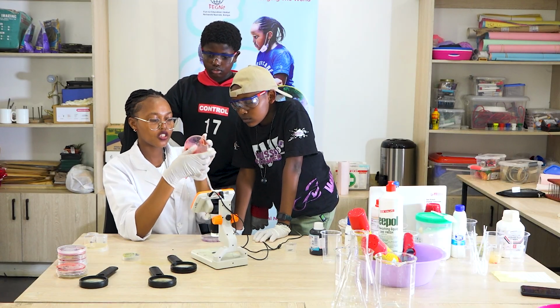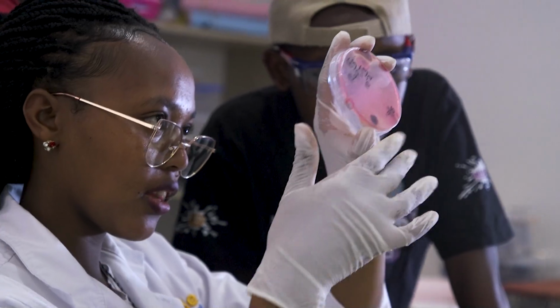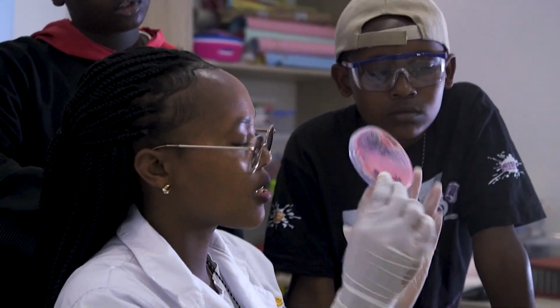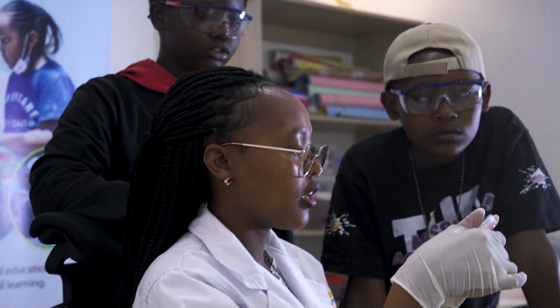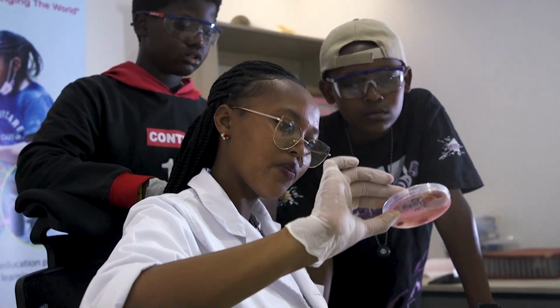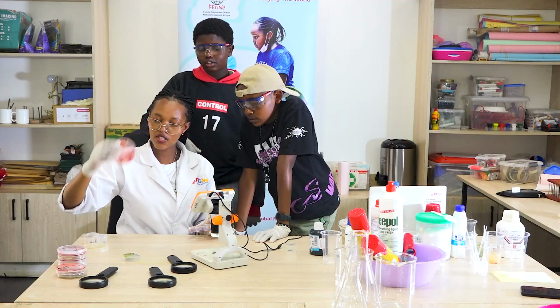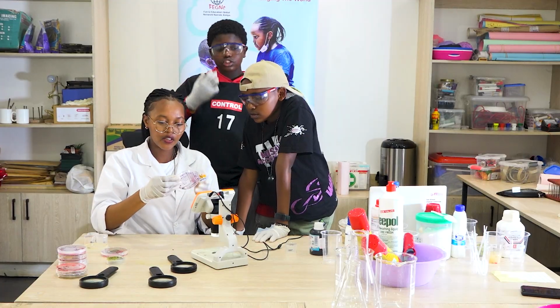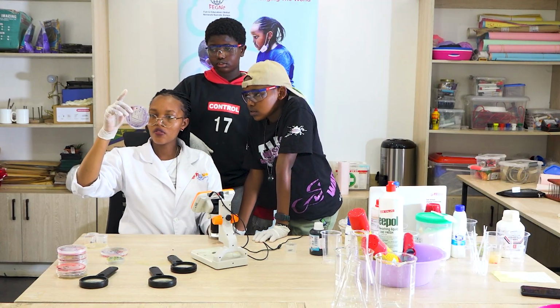You can see the pink background where the nutrients are under here. If it exhausts the nutrients, it stops the growth. As of now, you can see the growth has stopped. This was a fungus, and now over here we have bacteria.